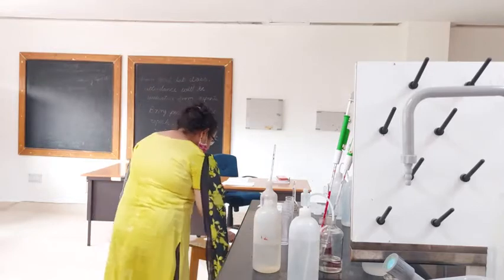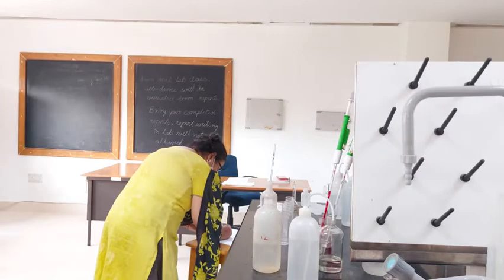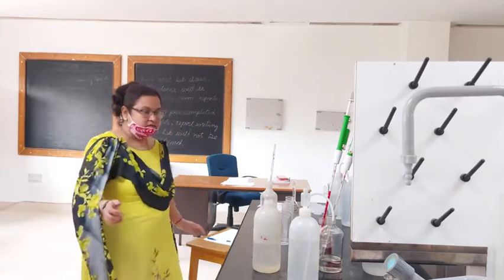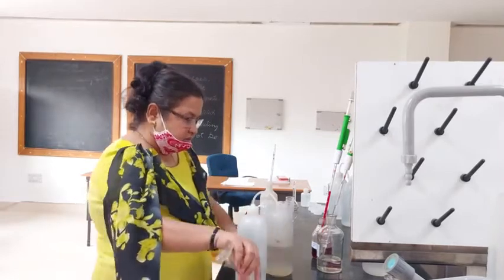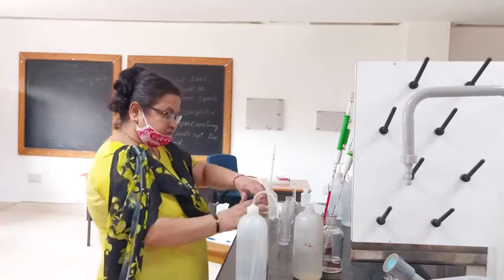This is river water. Then again I have to rinse it. Then groundwater, 50 ml.